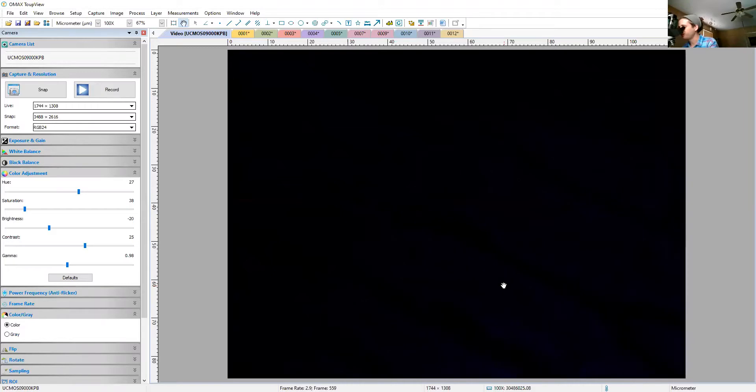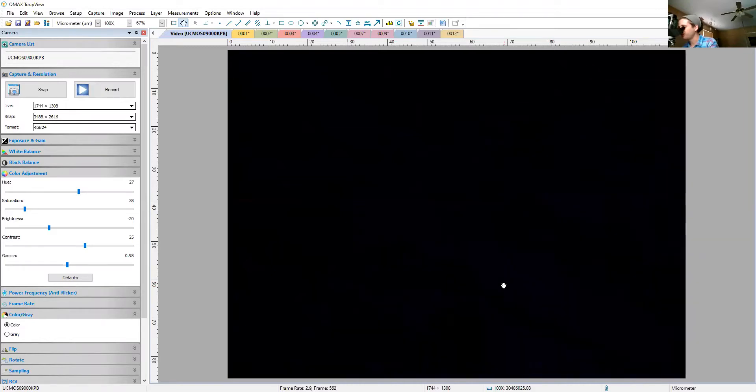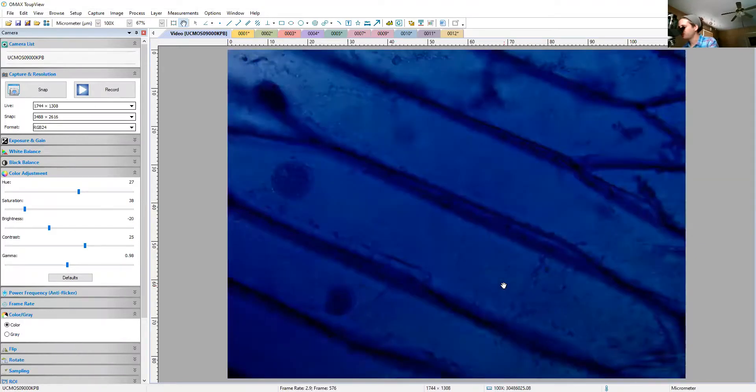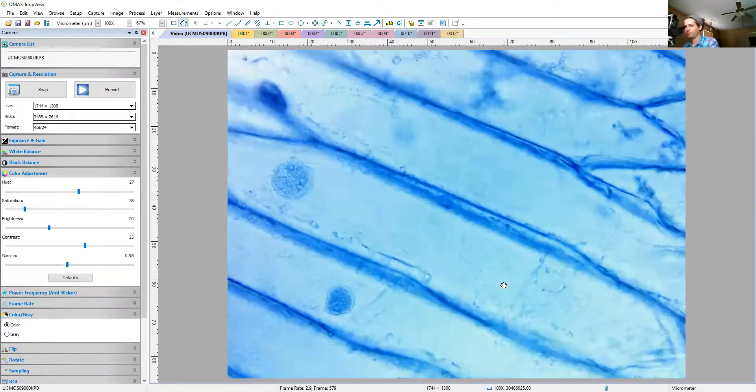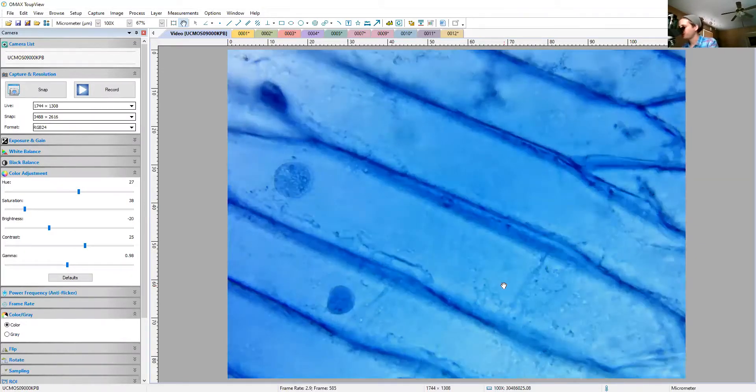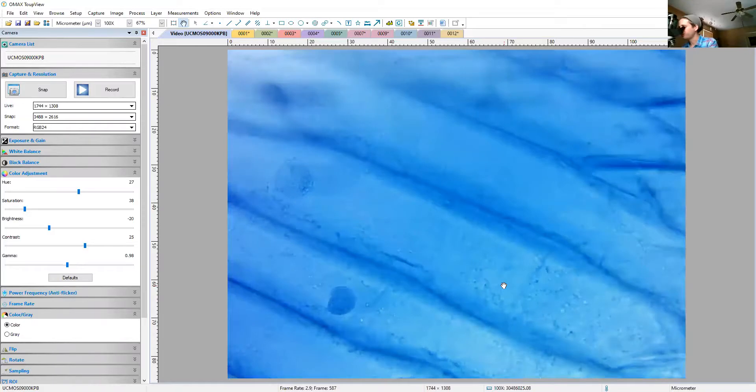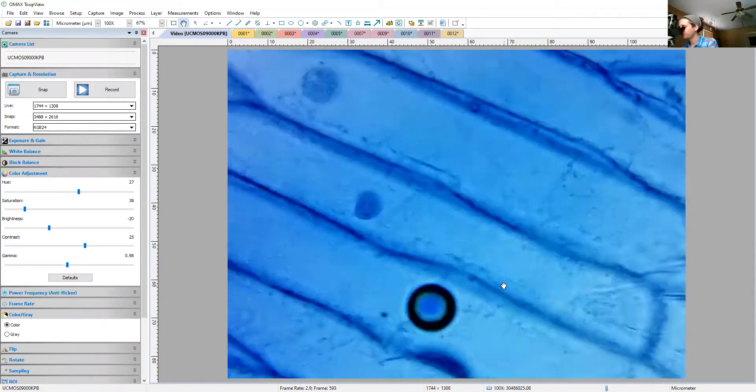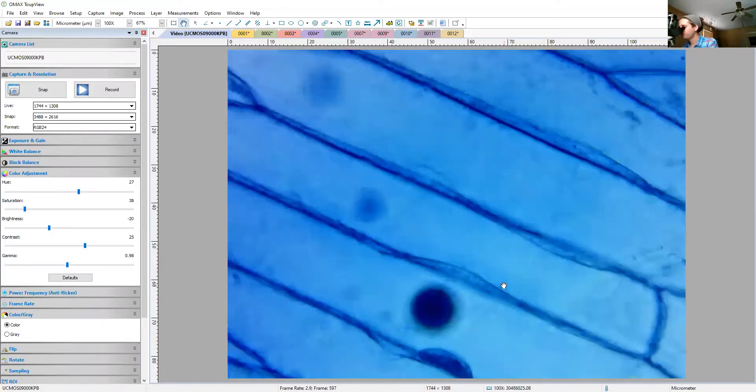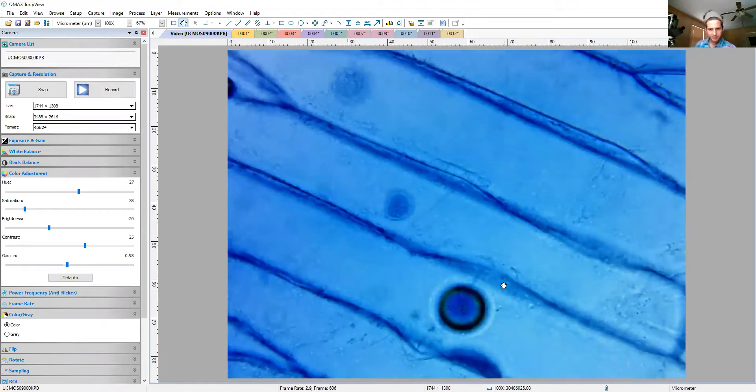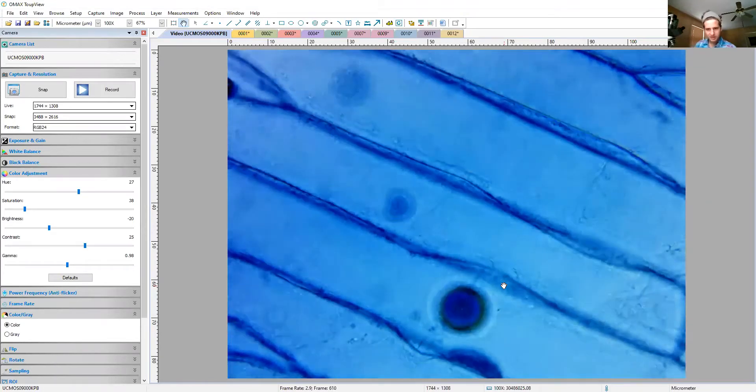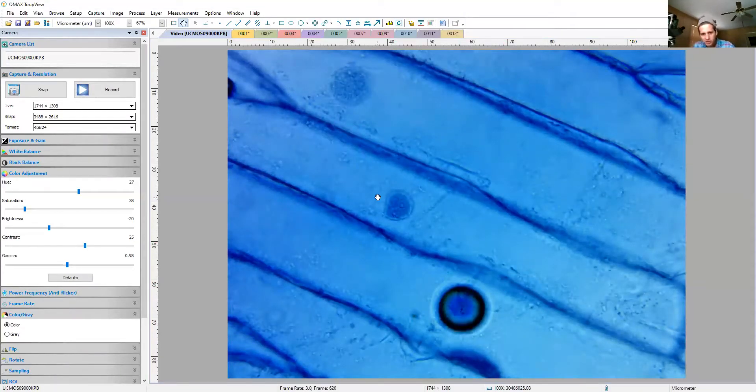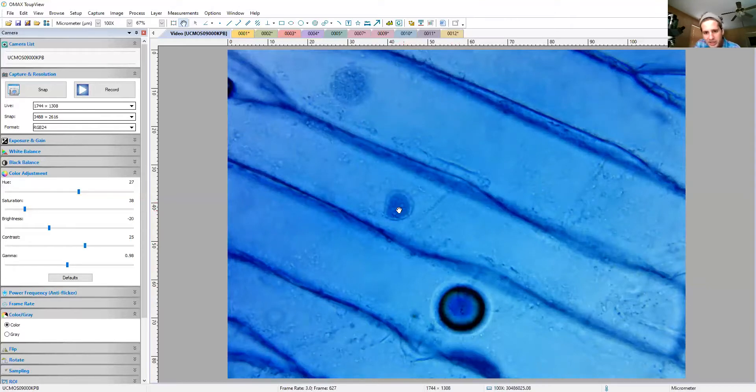Okay, so what you're seeing here is your onion cell, and this dark structure with a little bit of grainy stuff on the inside is your nucleus.